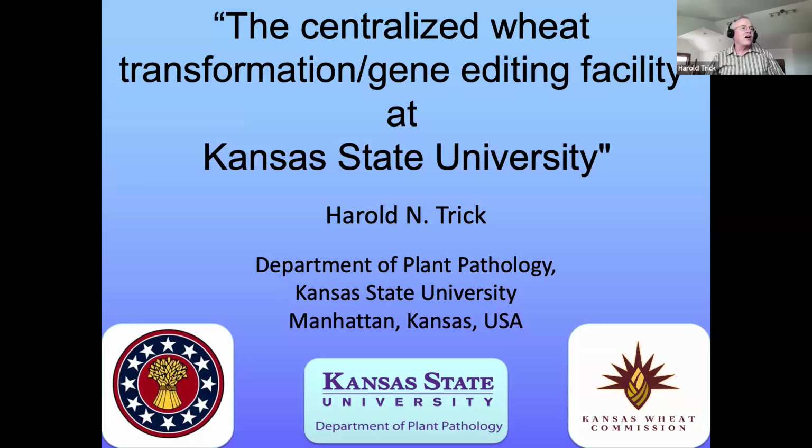Okay. All right. So the centralized wheat transformation facility, I also have the gene editing facility here at K-State. The reason why this was initialized with the scab community was we have a lot of specialized functionalities going into trying to create transgenic wheat or gene edited wheat. And we felt that all that redundancy would actually take away from the amount of money that everyone is able to utilize for their research projects. So that's why this was initiated.